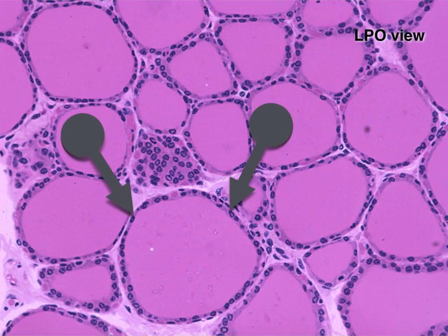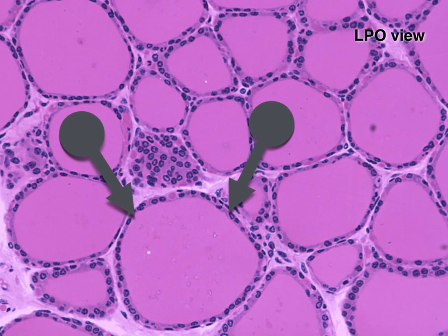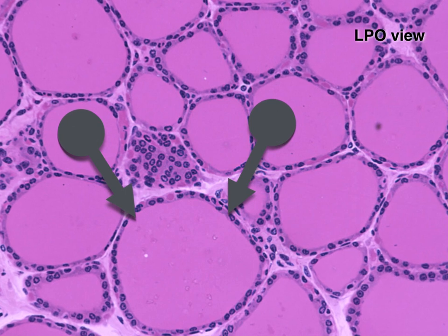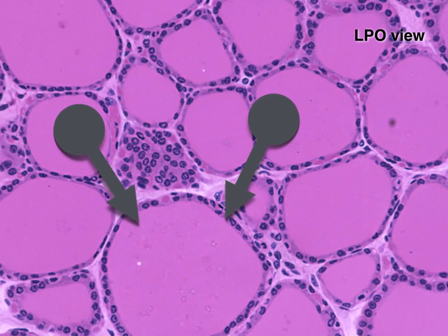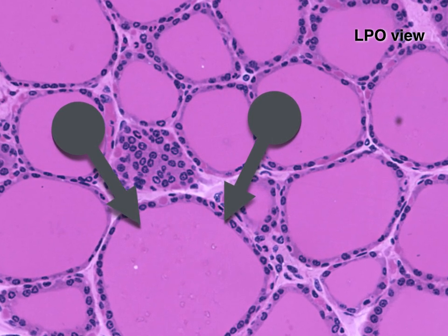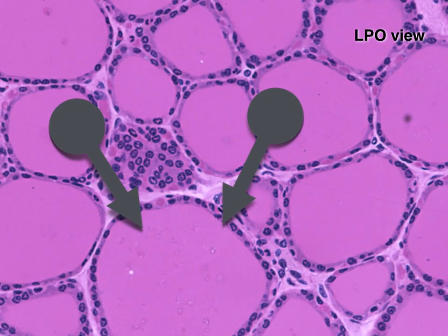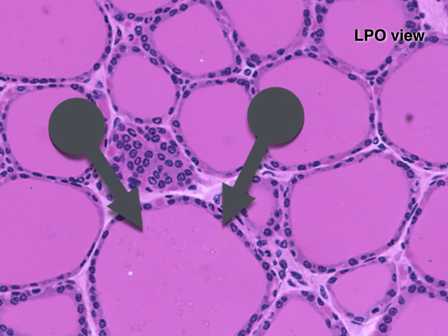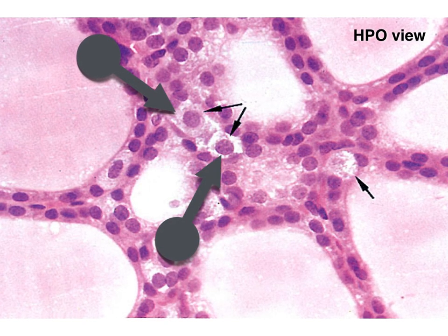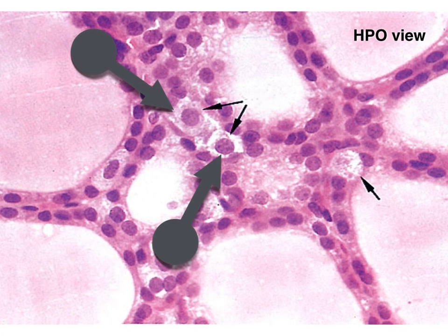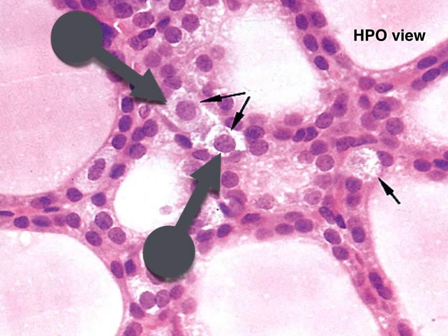The thyroid has a characteristic appearance under H&E stain. Most noticeable are the thyroid follicles, shown by the two arrows. They are composed of cuboidal epithelial cells called principal cells, surrounding a lumen filled with colloid. Colloid consists primarily of thyroglobulin. Also visible in this slide are a few C-cells, or parafollicular cells, scattered in the spaces between follicles. C-cells secrete calcitonin.